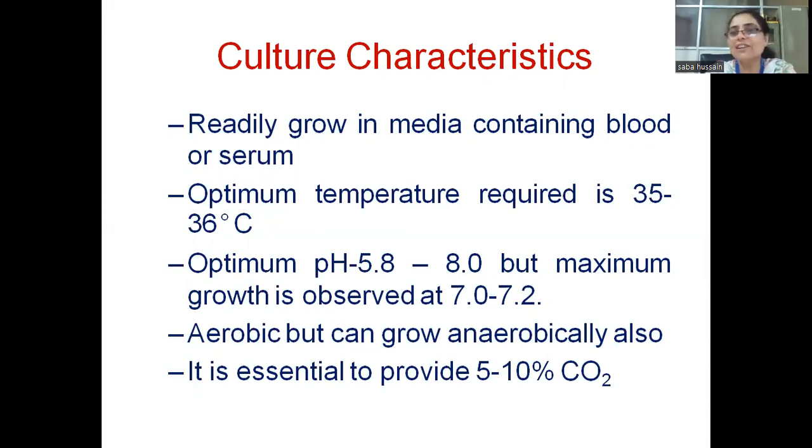There we have added trimethoprim to avoid Proteus, because Proteus is also one of the leading causes of UTI infections. So while we are collecting the specimen, it may get contaminated with Proteus also. So when we want to culture Neisseria gonorrhoeae, we have to add trimethoprim.